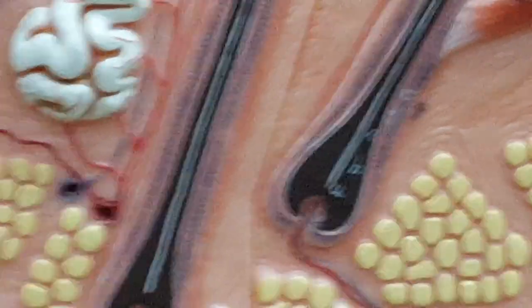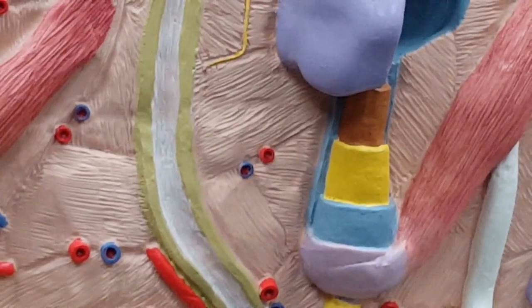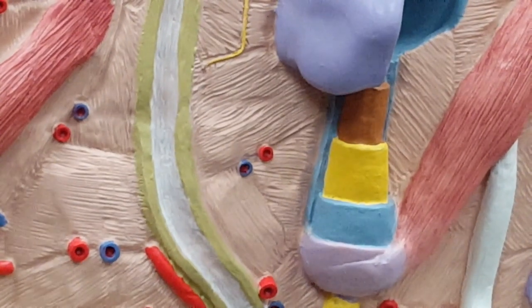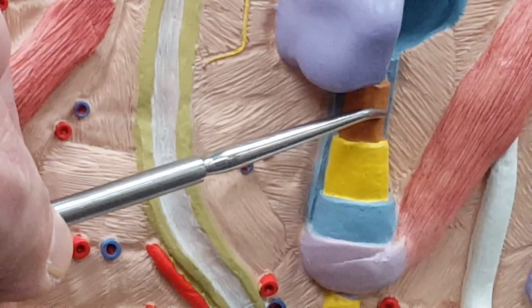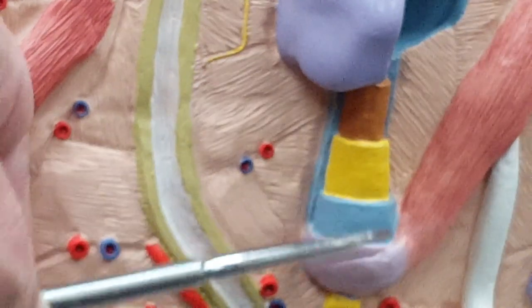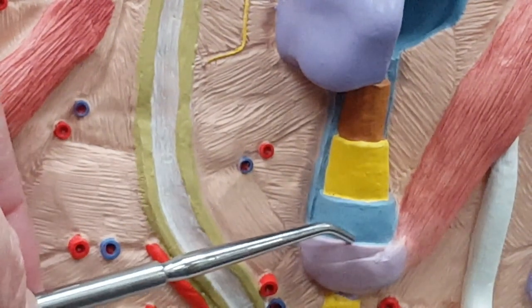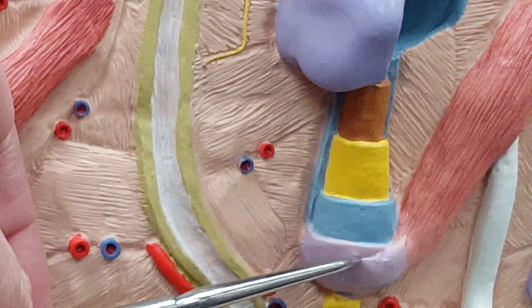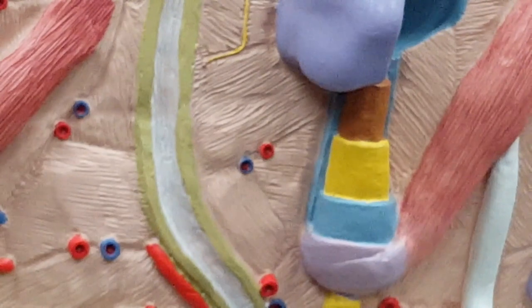Here's one that's very nice and I think easy to identify. Take a look at this one. So there's the actual hair. I'm tapping on the cuticle right there. This is the internal root sheath, external root sheath, dermal root sheath. So always start with the dermal on the outside and then count your way in. Dermal, external, internal root sheath. Like that.